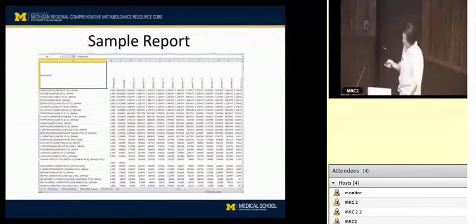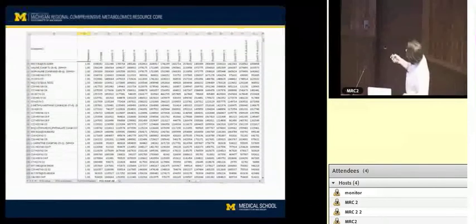And then again, if we did the molecular formula generation, if you have a little bit older data set, you'll see some of the compounds will have a formula. Ones that don't in this report, for example, line 98 here, one that just has a mass at retention time, that's what that means. Mass at retention time would be something it couldn't find a formula for whatever reason. If it doesn't have any isotopes, it can't find a formula, for example. But in general, we more or less report everything now as just mass at retention time or a named compound.